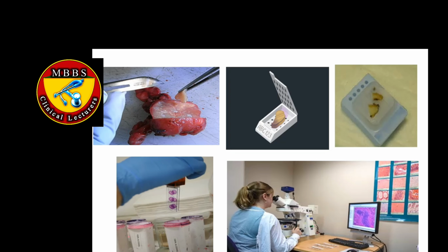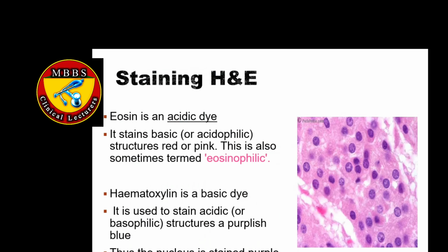The final slides are sent to the histopathologist, who puts them inside the microscope and watches, and he may watch it alone, or he may use a terminal to be shared with his residents or junior fellows. Staining with H&E uses an acidic dye, as you all know.